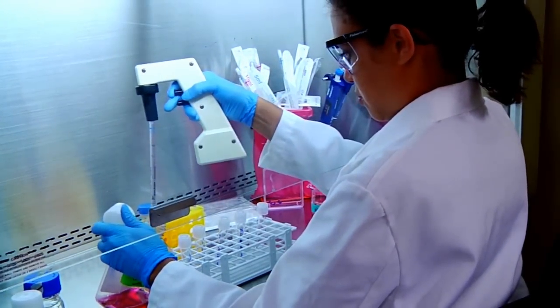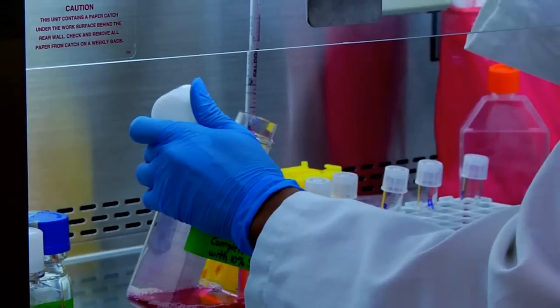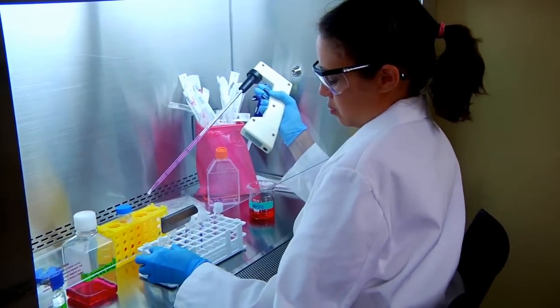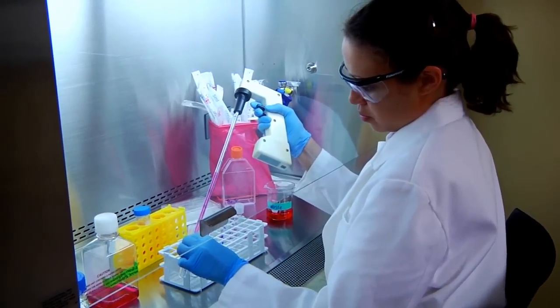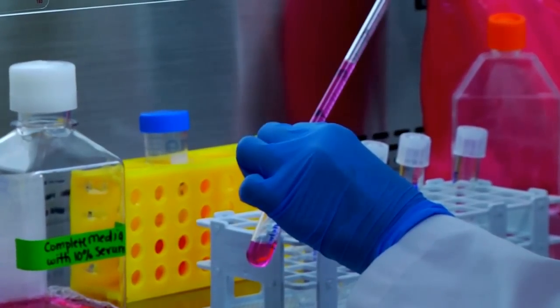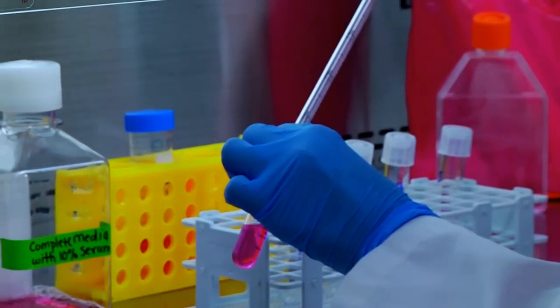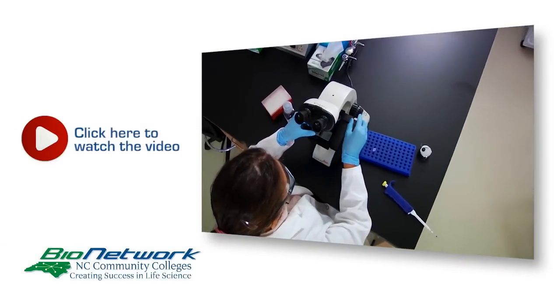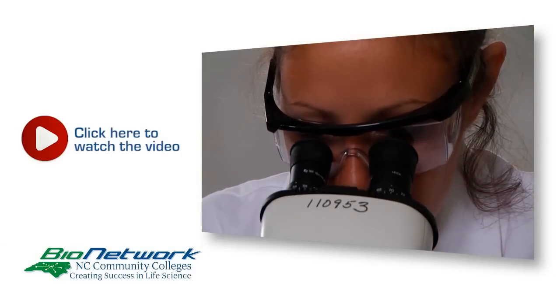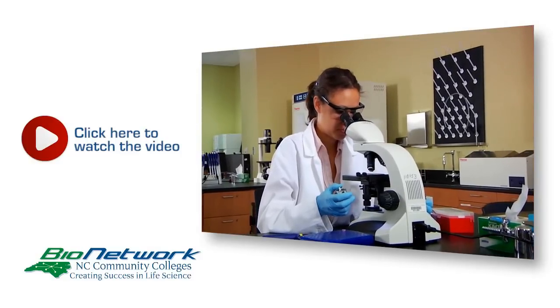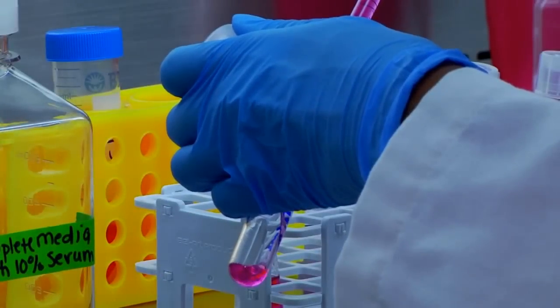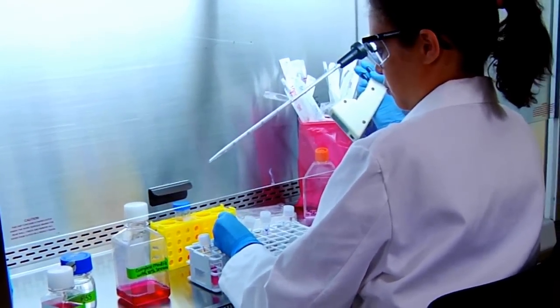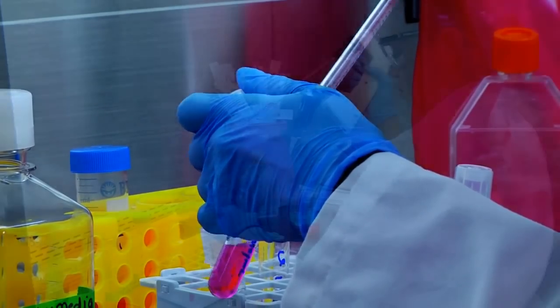Let's go back to the lab to complete the serial dilution. Add the appropriate amount of cultured medium to tube number 1. Based on the concentration of our original cell suspension, we've calculated the volume of cells and cultured medium we need in order to have a final concentration of 10,000 cells per milliliter in a final volume of 5 milliliters. Click the link on your screen to learn more about these calculations. Now add 4.5 milliliters of medium to tube number 2 and add 4 milliliters of medium to tubes 3, 4 and 5.